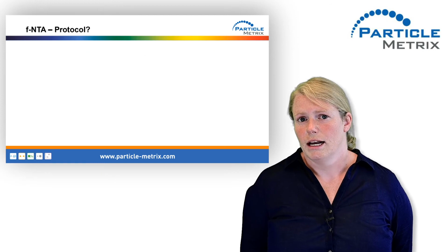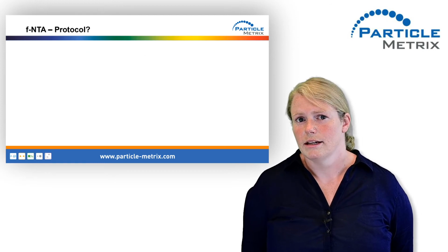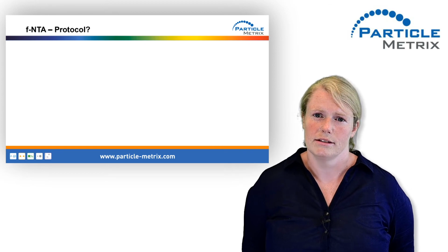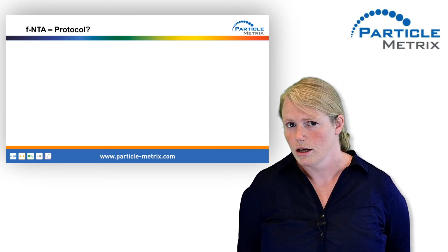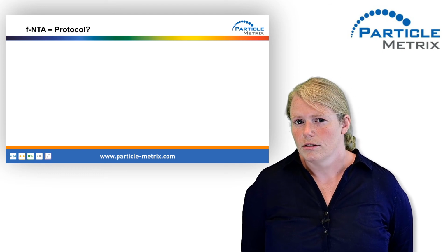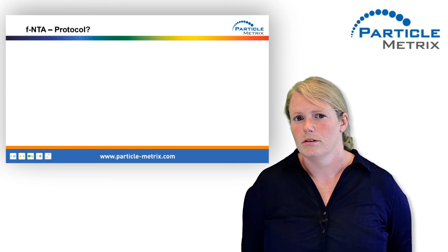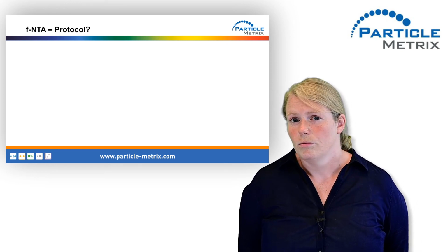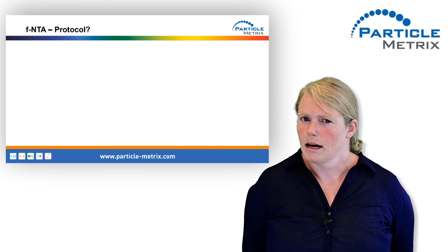Now I'm coming to my last topic, which is how to do fluorescent NTA in general. I'm sure most of you are doing other kind of fluorescence analysis, like flow cytometry or fluorescence microscopy. So you might have already protocols for staining. But these protocols are often not usable for F-NTA. Why not? We have to understand the challenges to overcome them.